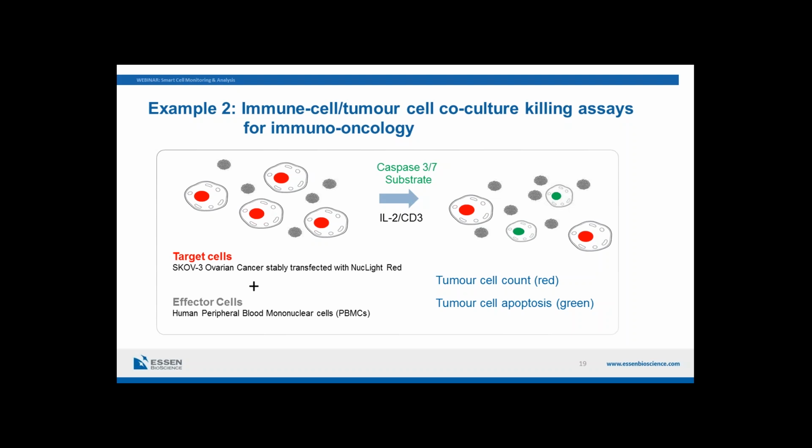We activated the co-culture with IL-2 CD3 to prompt the effector cells to target the tumor cells. We measured the tumor cell number and the apoptotic cell death by quantifying the red and green channels respectively.